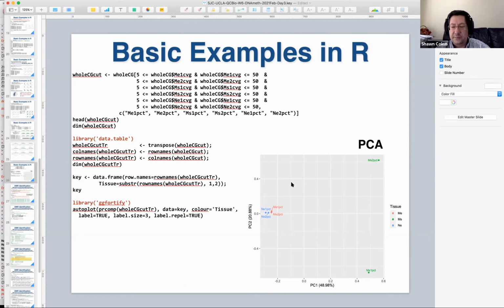So that is our PCA plot. Principal component 1 is mesenchyme versus the other two. PC component 2 is the two replicates of that against each other, so that is a more variable one, right? The two other replicates pair better than they do to each other, which is great. So this isn't that crazy. We should maybe start wondering about why this dimension is so big, but otherwise, not too bad. There's all kinds of parameters that share here and so on, but that is more or less how PCAs go.